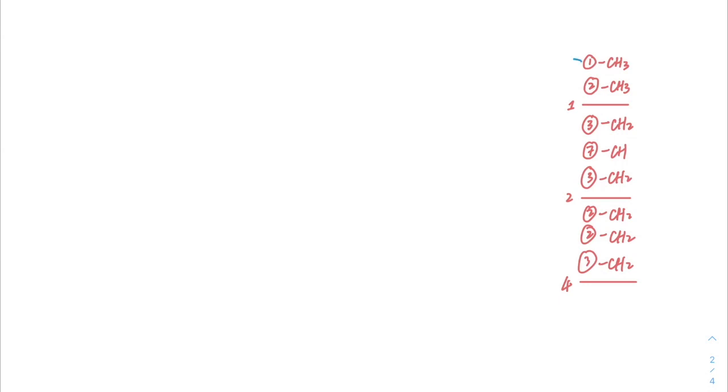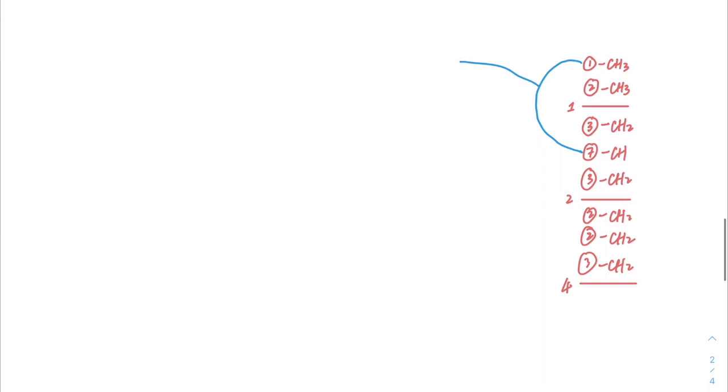Let's start with the hydrogen with only 1 neighbor. This 1-neighbor CH3 must be bonded to the only CH in the whole group. And let's see how many neighbors the CH has left. Previously it had 7 neighbors, but now because I have a CH3 next to my CH, 7 minus 3 equals 4.